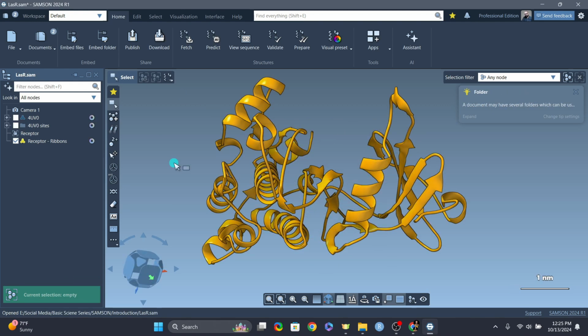All right, so that was all for the introductory video on SAMSON. I hope that you were able to understand and also able to follow along and see for yourself the different modes that are available. I'll be making more videos on SAMSON, and I'll be frequently using this tool for my research also, because a lot of the visualizations are really new for me, and I can see there are various things that I can do in SAMSON. So I hope you will also get the idea of using SAMSON for your research.